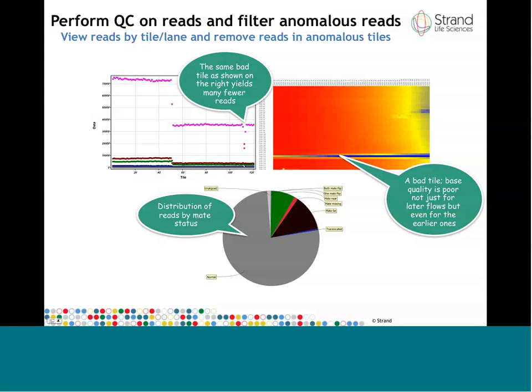And if only one of the reads maps and the other doesn't, then we say it's a case of mate missing. And if both the reads map and they map at the right expected distance, then we say it's a normal pair. The proportions of the various read pairs that are normal, mate far, mate missing or mate near are shown in this pie chart.